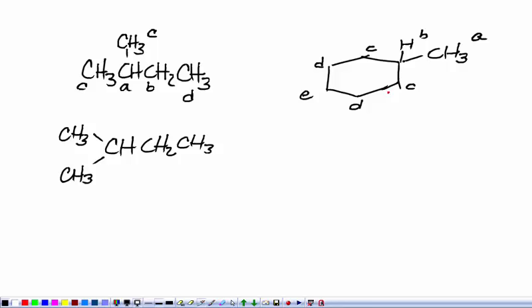So does that mean that there's going to be 5 peaks between 7 and 8? No. So what does this 5 mean again? Well, let me deal with the 7 to 8 issue.